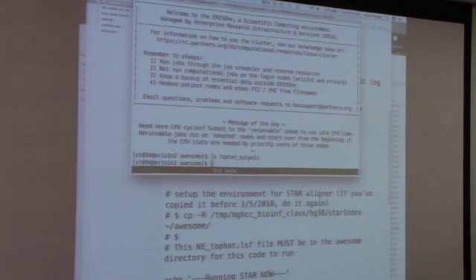So it's because we have the cd command in the test.lsf. Oh, yeah, cd. There's a cd, so it brings you back to your home directory. So the output file is on your home directory, not in Awesome. Oh, yeah. So we all forgot to change that to the Awesome directory.